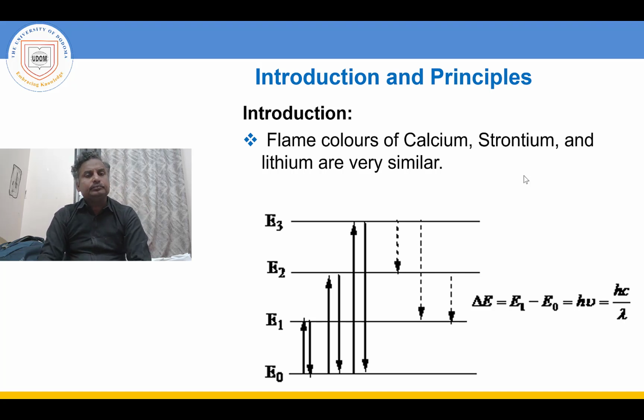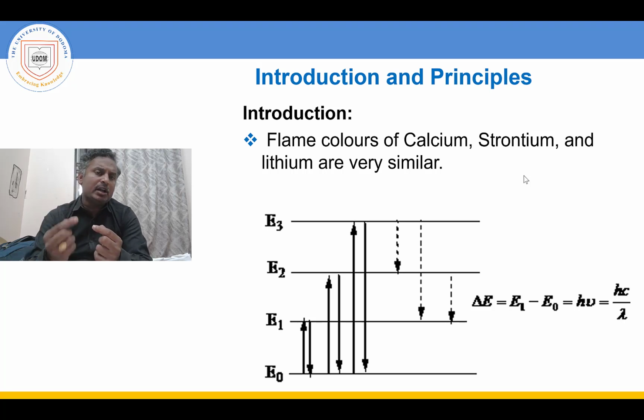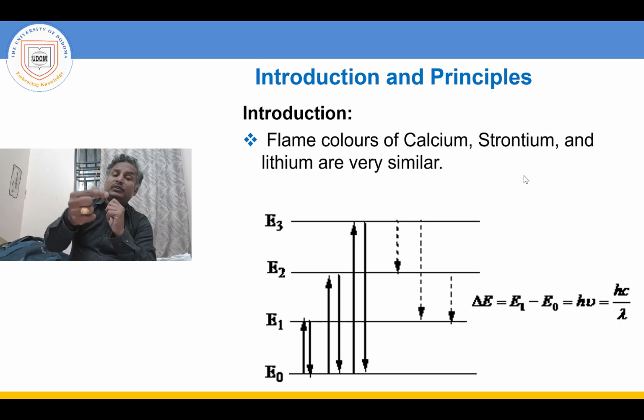How will you do that? You need to take a watch glass and place a particular unknown salt sample in it, and add 2 or 3 drops of hydrochloric acid. After addition, you need to make a slurry of the salt using a glass rod. After making the slurry, you take a pinch of that salt on a glass rod and introduce it to the flame.